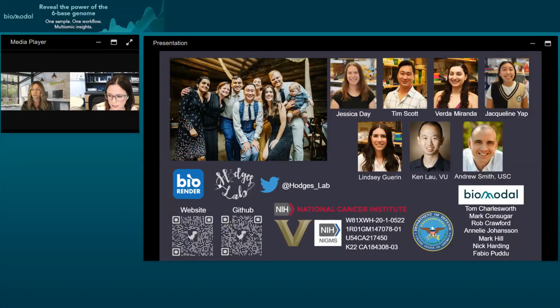And the other major difference is that I won't go into all of the detail, but I would definitely refer you to the publication. There are several enzymatic steps that include glycosylation and methyltransferase steps. Several enzymatic steps, prior to deamination, enable you to distinguish between hydroxymethylation and methylcytosine. Bisulfite sequencing doesn't have those steps that allow you to do that.